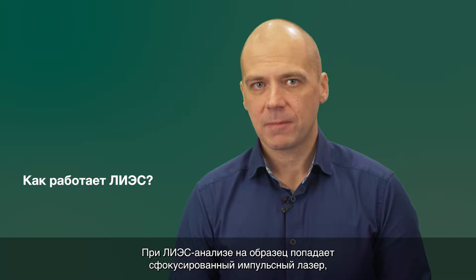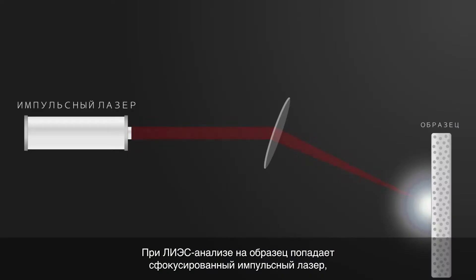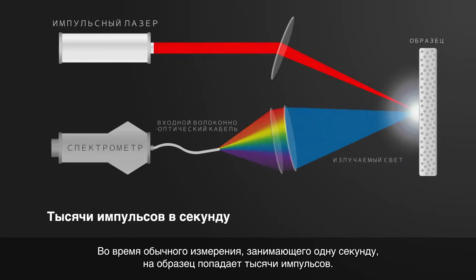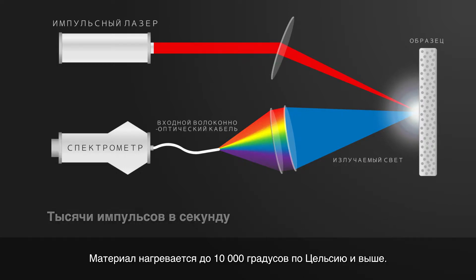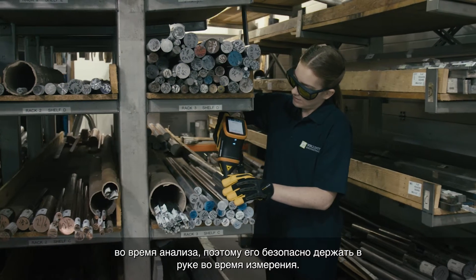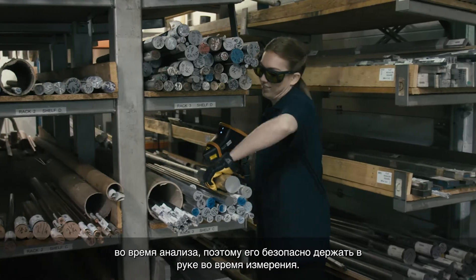During LIBS analysis, a focused pulsed laser hits the sample, removing a very small amount of material from the surface. The sample is hit by thousands of pulses during a typical one-second measurement. The material is heated up to exceeding 10,000 degrees Celsius. The temperature is so high that the atoms actually break up and form a plasma. Despite these high temperatures, the sample does not get hot to touch during the analysis, so it can be held in your hand safely during the measurement.